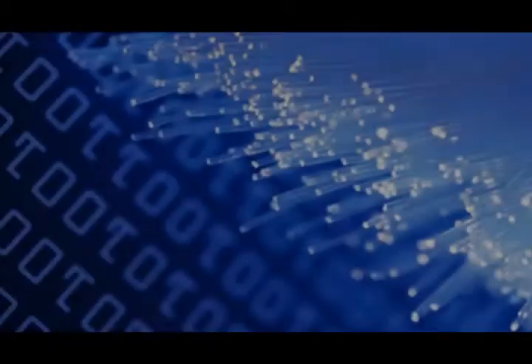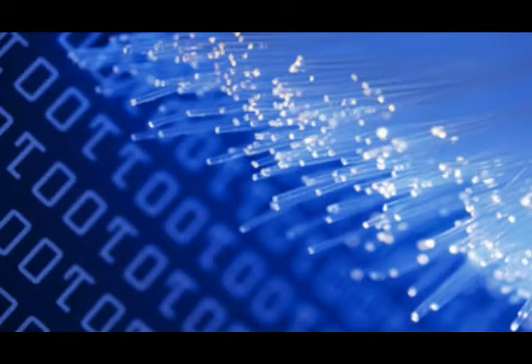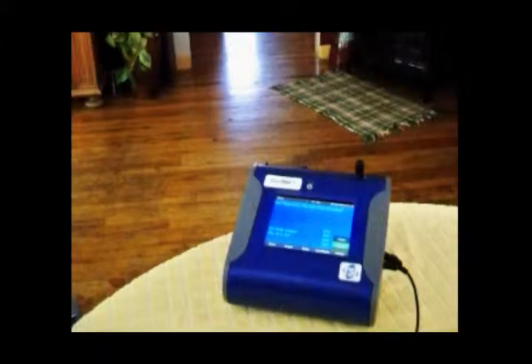There are two ways of electronically retrieving data after a sampling event has ended. Both will be discussed, offering two different results. Also covered are some tips on recording data by hand.